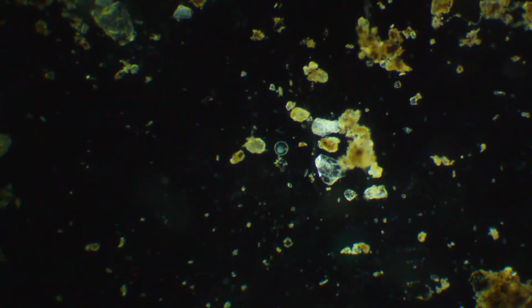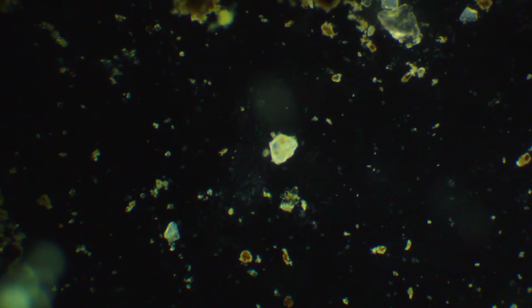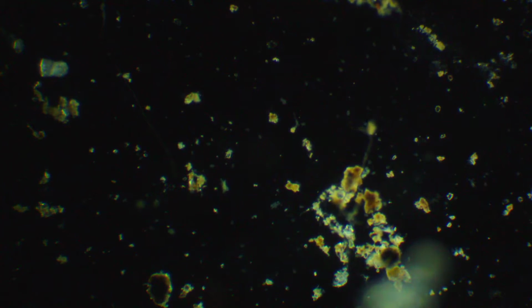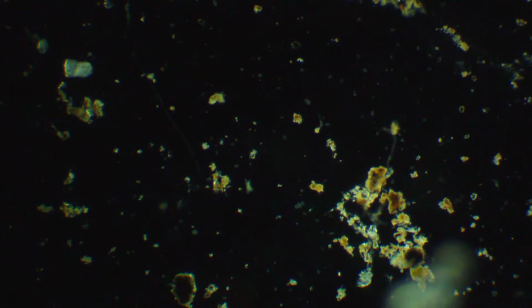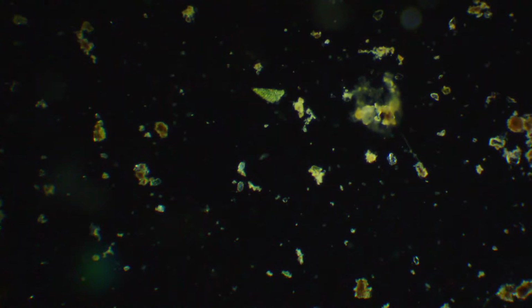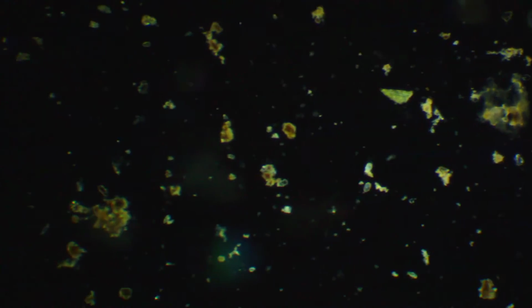Anyway, I like the dark field setup with this. We're looking at these guys because you can see all the colors. I think you can see the bodies against the dark background a little better than the light, which is more like a greenish gray unless you go super bright. All these little bugs everywhere.